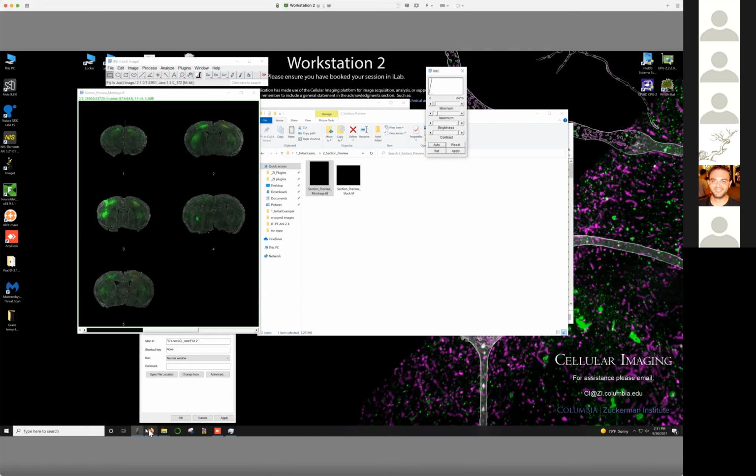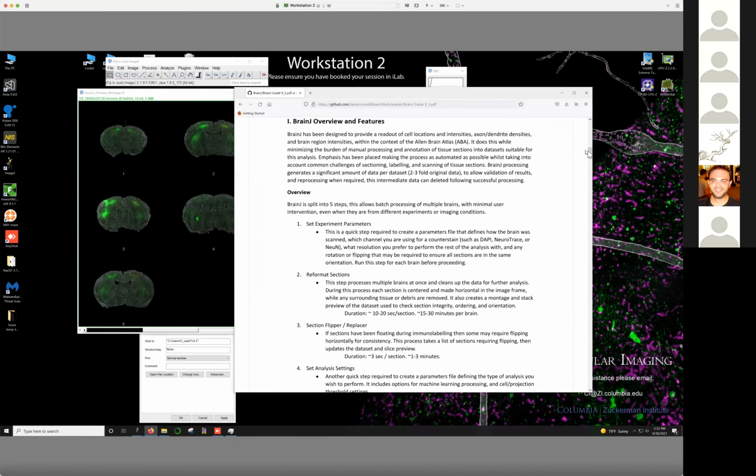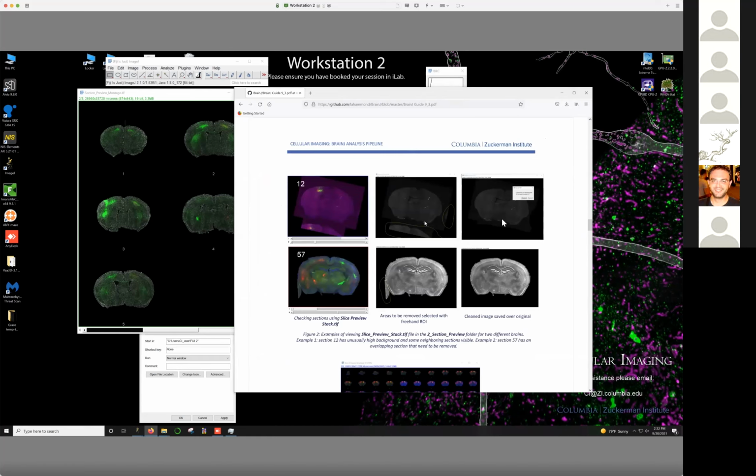In fact, in the manual that I put together, this is actually covered. So here, the pipeline's pretty robust to this first issue. But with this second issue, if there's tissue that's really touching the main section, the sections are going to be registered, but when aligned to the template brain in 3D space, this is going to look like part of the outer cortical layers of the brain. The atlas might try to map onto this, or probably won't map onto it fully, but you're going to have some deformation here, and that's going to affect the accuracy in this local area. If you want to avoid that, we would just manually edit that channel. I'll show you how to do that now.